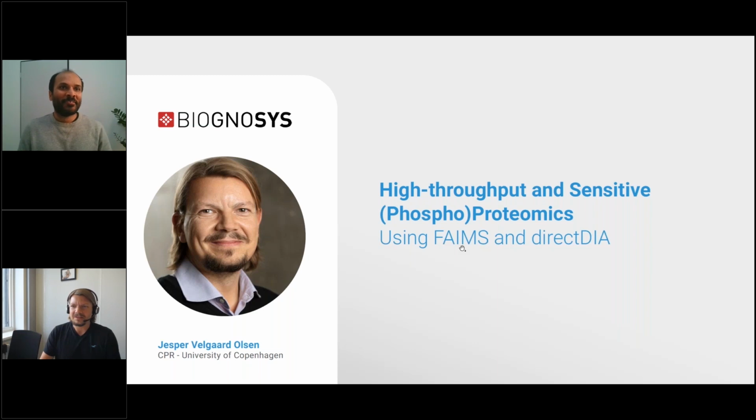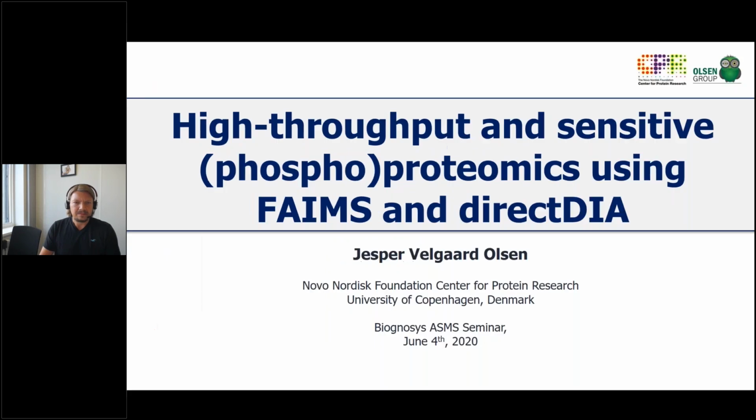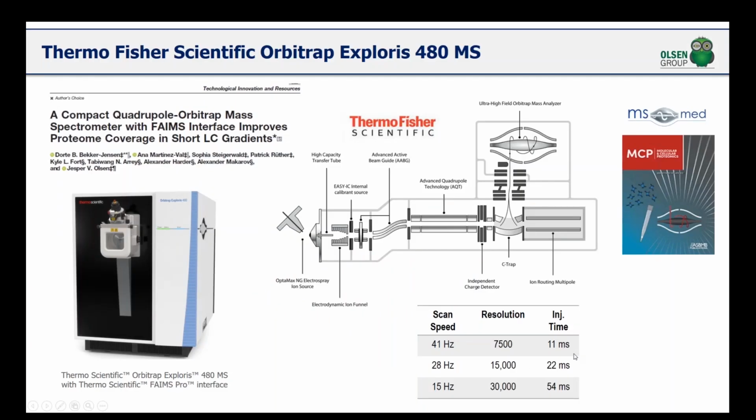Yeah, thank you, Tejas, for this kind introduction. And let me see if I can share my presentation here. First of all, thanks for the introduction and thanks for giving me the opportunity to show you some of our recent data that we have collected on the new Orbitrap Exploris 480 system, where we were fortunate enough to be one of the first labs to beta test this new instrument.